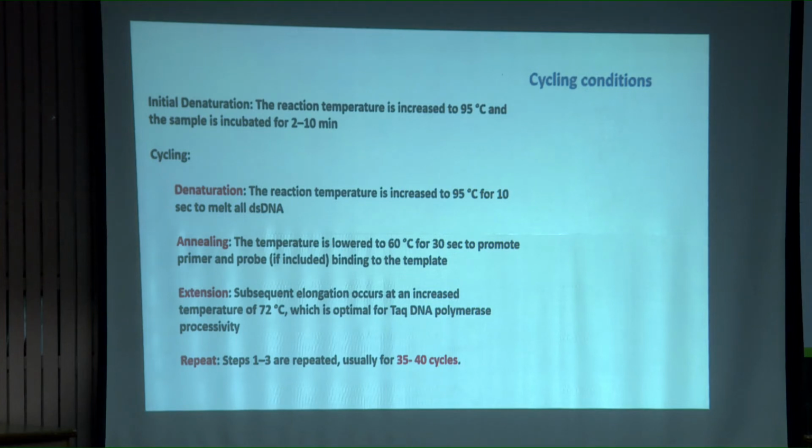So all resources are getting depleted with every passing cycle. People found that 30 to 40 cycles is the time point beyond which the PCR reaction can no longer be sustained. And that's the reason why it is 30 to 40 cycles, right? You can do it for 100 cycles also, but the quantum of product you get is almost the same as what you get out of 40 cycles.